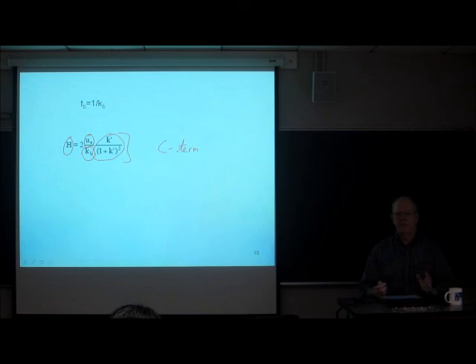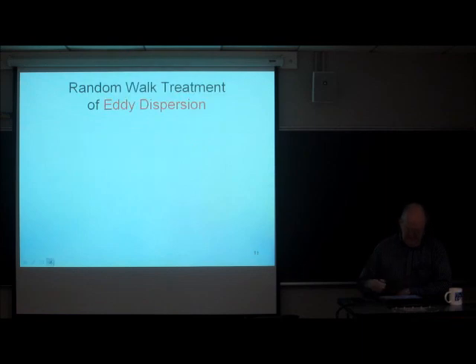If k prime is 0 and there's no retention at all, it's never going to move from the mobile phase to the stationary phase. Doesn't matter how fast or slow it does it. If it never goes, it never goes. It can't cause broadening. So that's B and C.